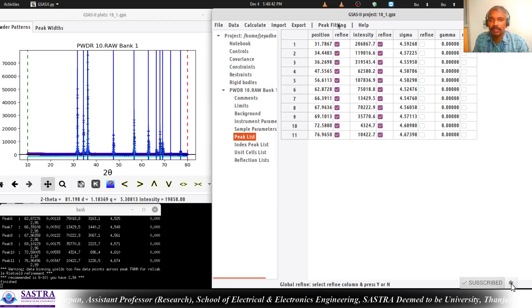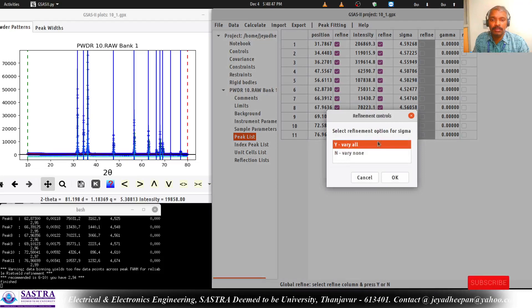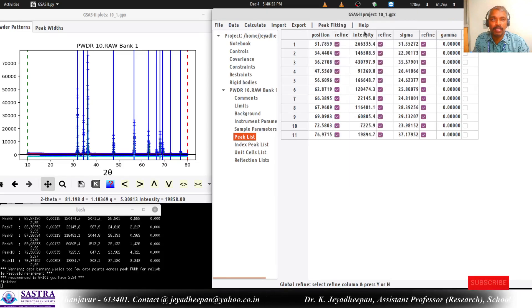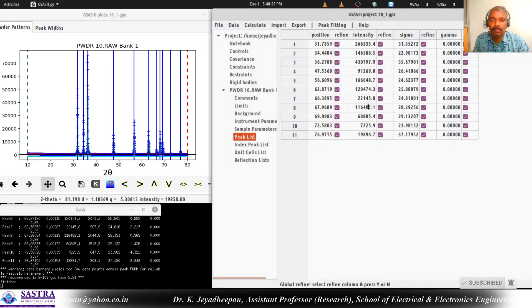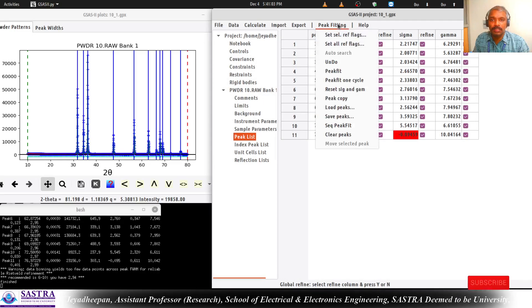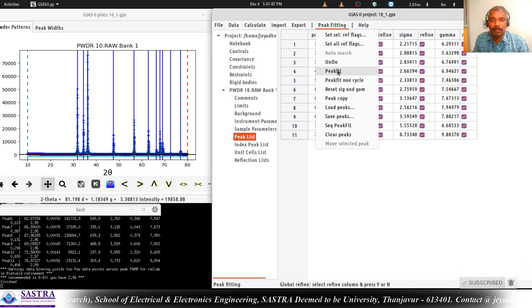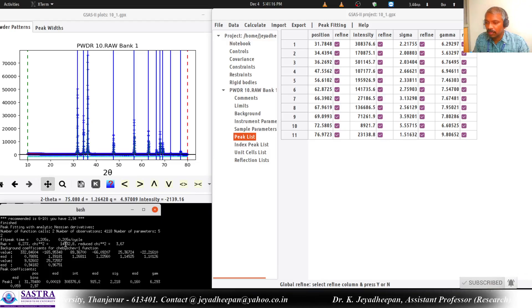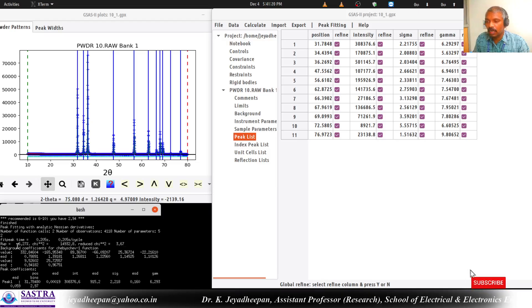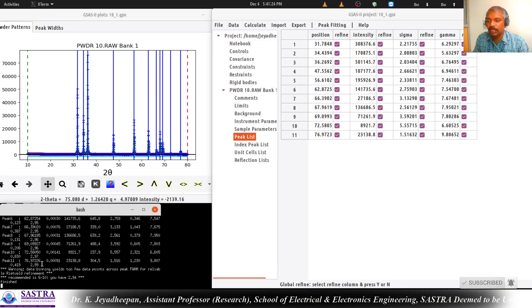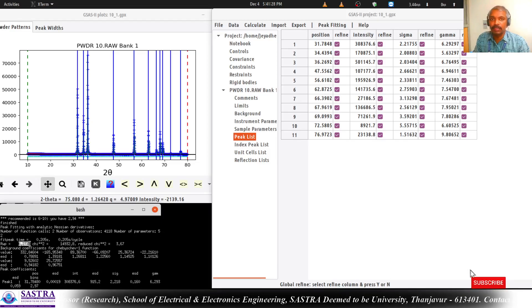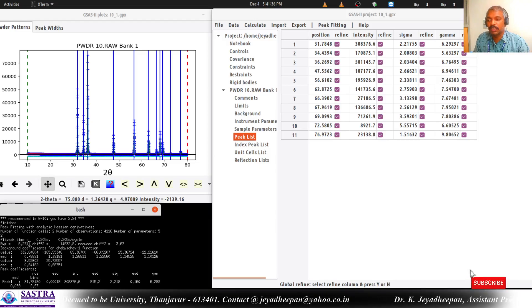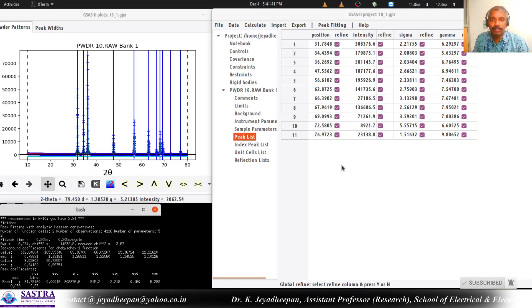Next is refining the sigma values. Now the RWP value is 23 percent. Now I am going to refine the gamma value. Now you can see 6.27 percent - in the pop-up the RWP is 6.27 percent. In the bash window you can see the refined parameters: reduced chi-squared is 3.67 and RWP is 6.27 percent. I already told you RWP should be below 10 percent. Now it is 6.27 percent, so our fitting of all the peaks is very good. Now we can move to the next step.